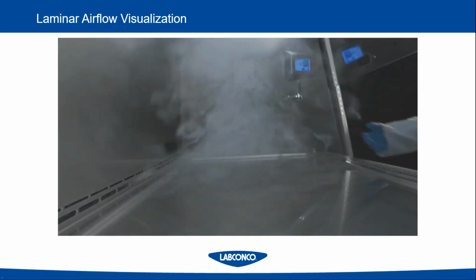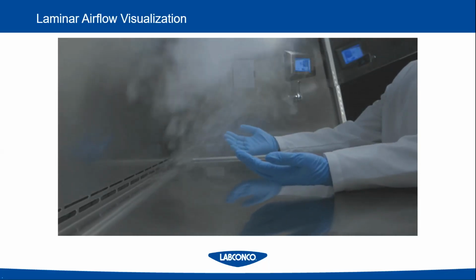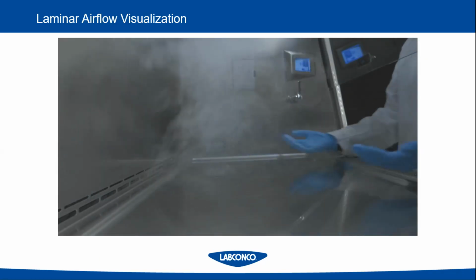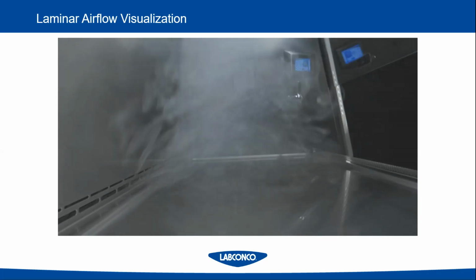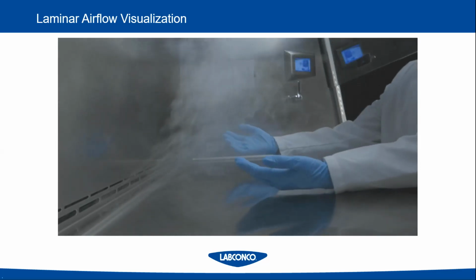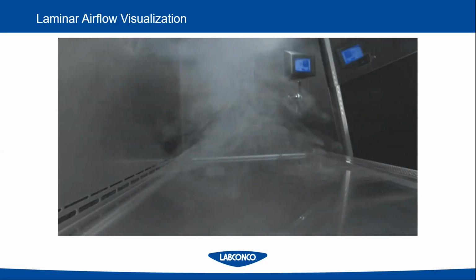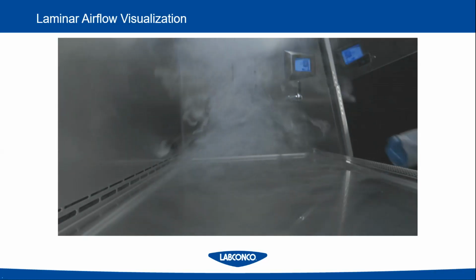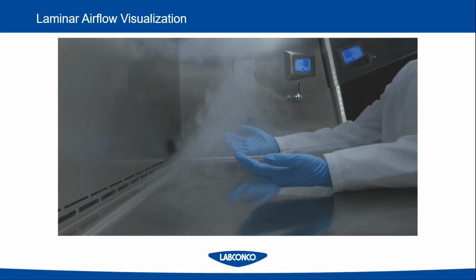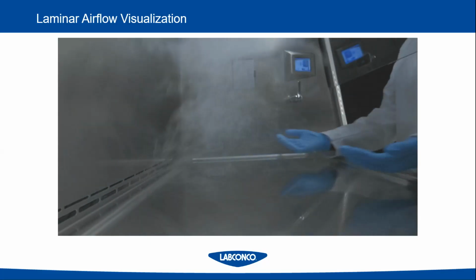So you can see we have a smoke generator at the top of the biosafety cabinet, and you can see the one-way airflow from the top down to the bottom. And you can see either the laminar air is captured through the rear airfoil slots and then moved through the HEPA filters again, or through the front grill and then taken beneath the work surface and recycled through the HEPA filters, the same pathway. This is important because it's a one-way laminar airflow. There's no mixing or swirling of air. That means we always have a clean curtain of air over the entire work surface.